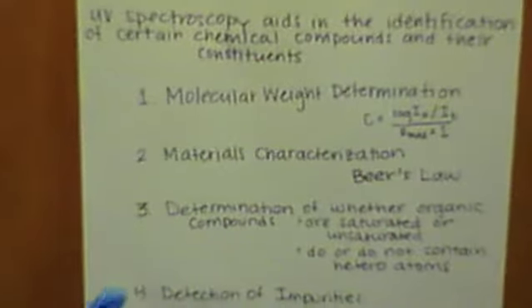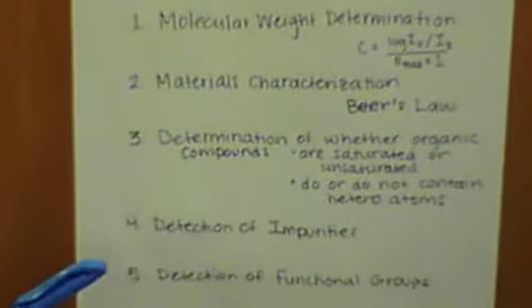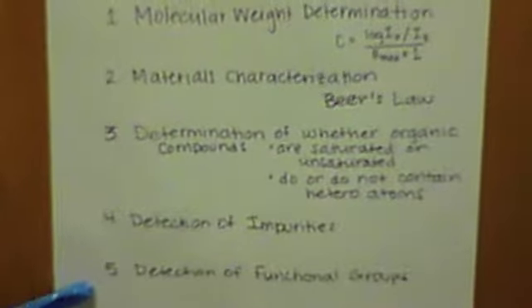And then we can also look at, using Beer's law, we can do materials characterization. We can also determine whether organic compounds are saturated or unsaturated, or whether they contain heteroatoms or not. And then we can also detect impurities, and we can detect functional groups.